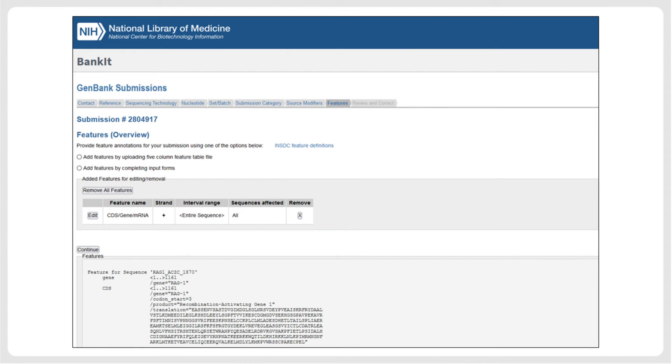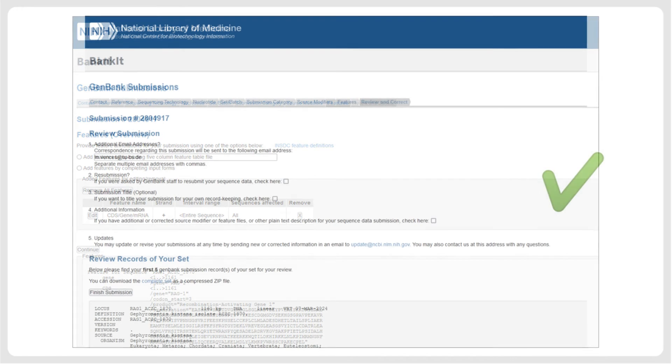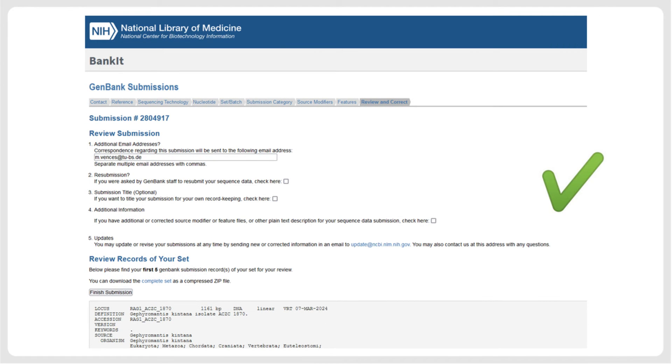We can then review the translated amino acid sequences. After reviewing the translated amino acid sequences, we can then review the dataset once more before confirming the submission.